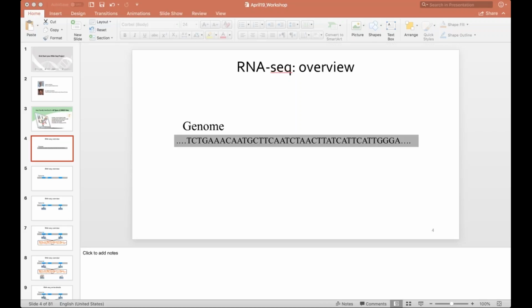So transcriptomics 1, 2, and 3 give a full overview of how to process raw data, how to do simple things like differential gene expression, and then also how to apply machine learning tools to analyze the expression tables. And we have a few other courses and a number of other projects that we are working on to make them available online. Now, we also have these workshops, and these workshops are focused on specific topics. You can see some of our previous workshops that we did this month. We are also planning a summer bioinformatics series of workshops in collaboration with a number of universities.